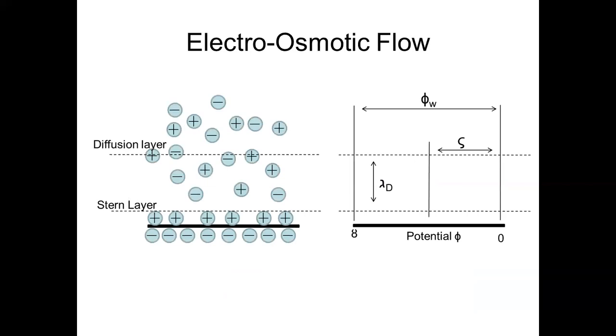I always remember electroosmotic flow because of the O in osmotic, the letter O. To me, that's like a snake swallowing a mouse. So it's the sidewalls that are actually moving the mouse along the digestive tract in the snake. And that's how I remember electroosmotic flow and what it produces. At least that's an analogy in my mind that helps me look at or analyze this process.